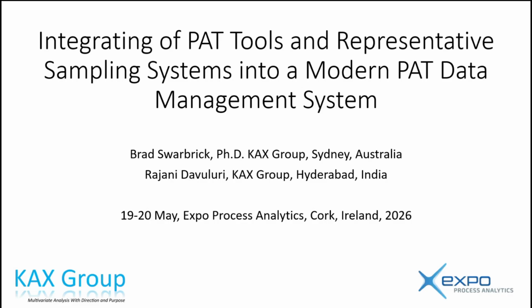I'm talking about spectrometers that we went from, I'll give you an example, going from 60 seconds per spectrum to 30 seconds per spectrum. That was brilliant. That was fast. And then all of a sudden the new instruments come out, the Zeiss Corona comes out. Oh, we can collect a spectrum every 10 seconds. Oh, but we can fry an egg on the instrument as well because it used to get that hot.